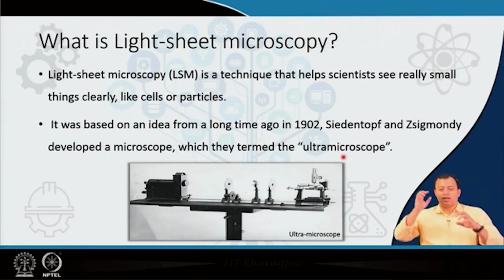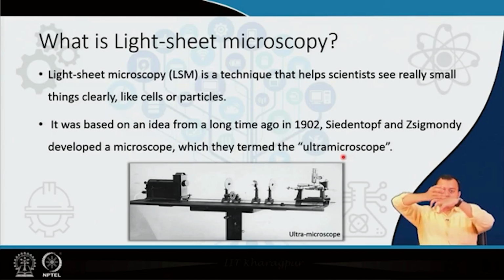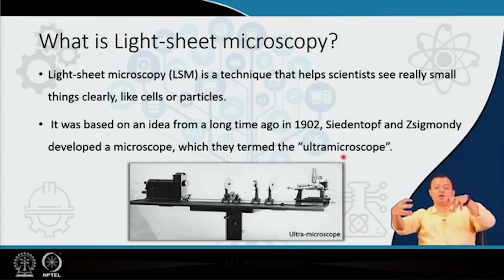What they did was they saturated certain samples with metal nanoparticles, metallic particles, and they illuminated the sample from, say, the top. They shone light on the sample from the top, but the detection, the measurement, was from an orthogonal 90-degree angle. So, if you are shining light from the top, you are measuring the light scattered from the side, a 90-degree difference. This is input, this is output, or if this is illumination, you are measuring it from up or from the bottom.